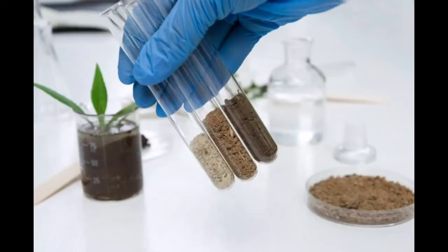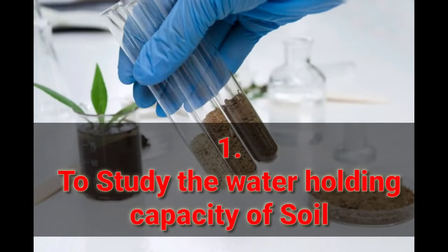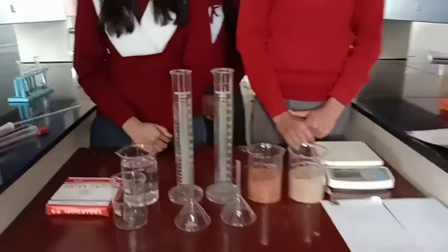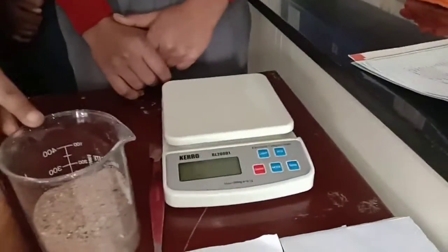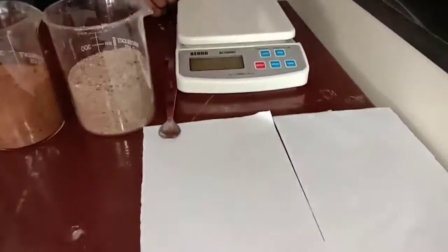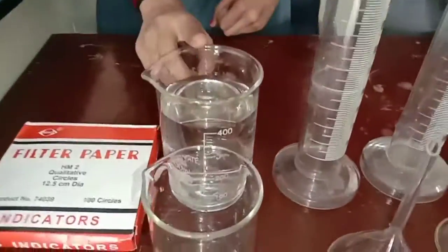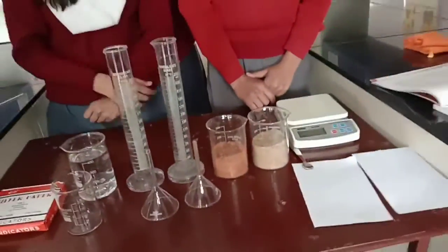Now dear students, it's time for the third experiment. Aim: to study the water holding capacity of different types of soil samples. Requirements for this experiment: we need soil samples, electronic balance, sheet of papers, spatula, measuring cylinder, a beaker full of water, one more beaker to measure the water, filter paper, funnel.